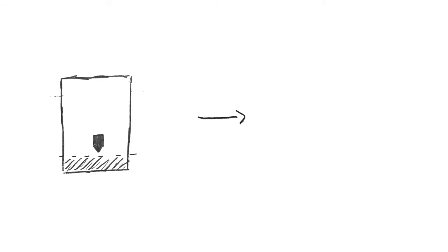So far, we analyzed the movement of the substance's components through a nonpolar liquid. What do you think will happen if the liquid was polar instead? It would depend on how polar the liquid is compared to the paper. So, let's assume that this new liquid is much more polar than the paper. Pause and take a while to imagine the results of the experiment in this case.